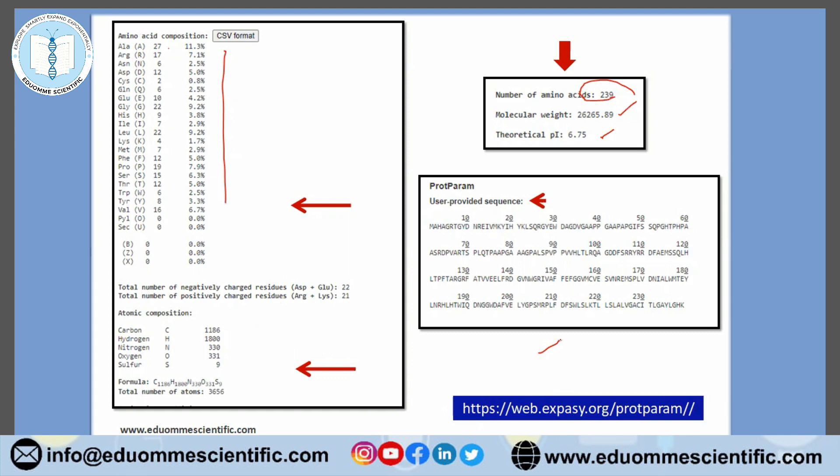So if your protein forms a dimer or multimer, then you have to paste your sequence two times and then compute. And for post-translational modifications, they are not providing any information about the impact of such modifications — that property is not given. But in the case of a dimer, you have to paste your sequence twice. So on the initial page, you will get these kinds of information.